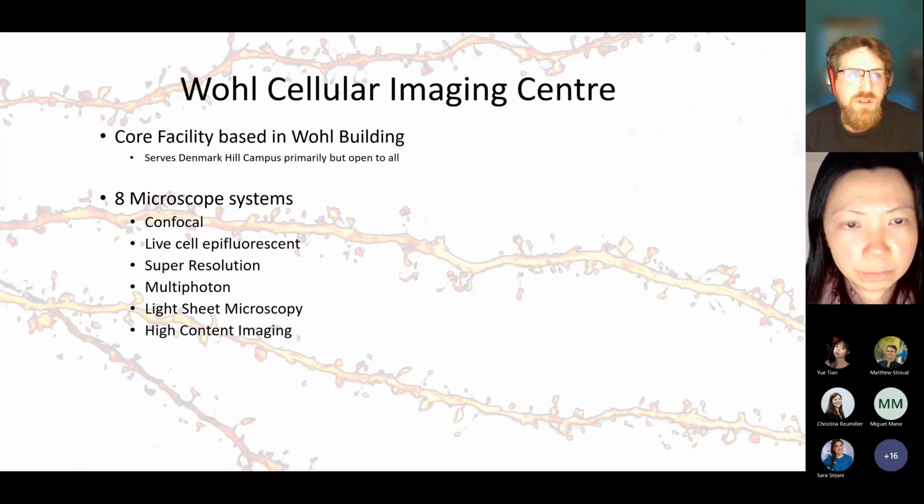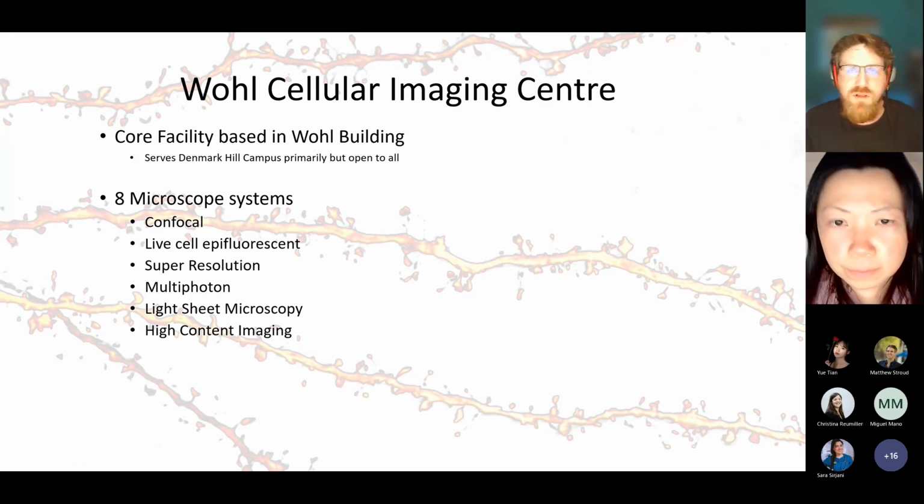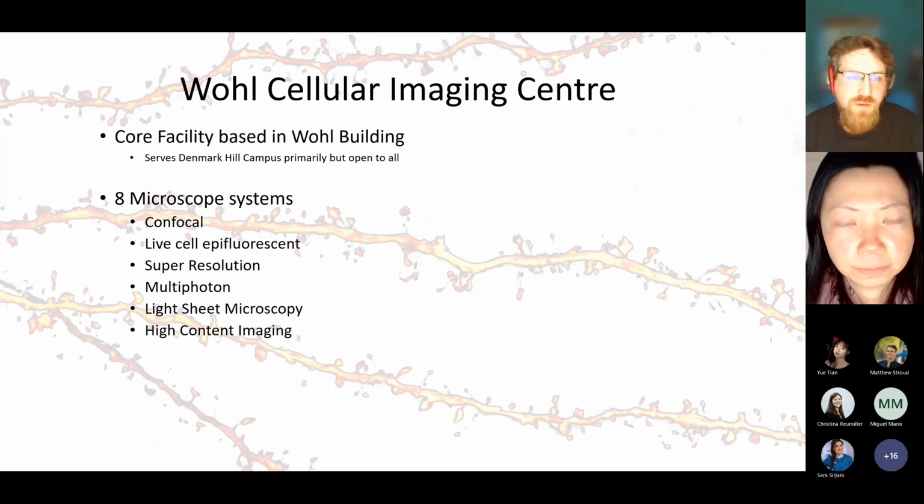But there are now commercial buffer kits which make it very straightforward, and you can store your sample for up to a month to do this sort of storm imaging. So that side of things has got drastically easier because that used to be very tricky.